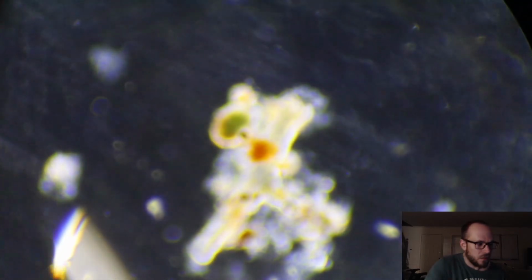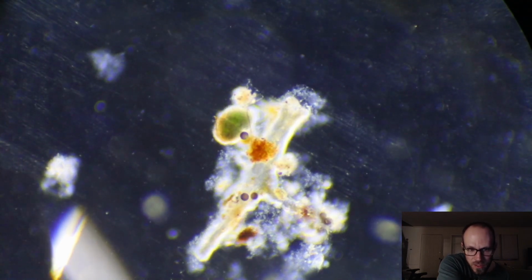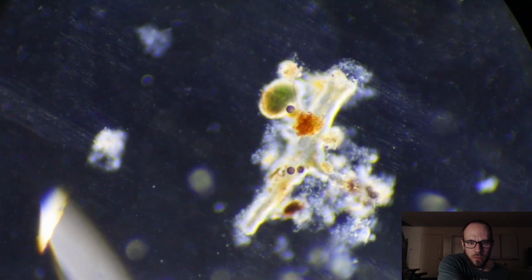Tell us your secrets. Reveal to us what you're about, bro. Okay, I'm seeing little orbs. Not sure what those are. Let's try and zoom in more on them. 400x deploy. Alright, removing filter and decreasing this. How is this not centered on those orbs?